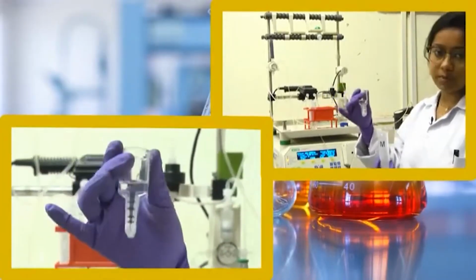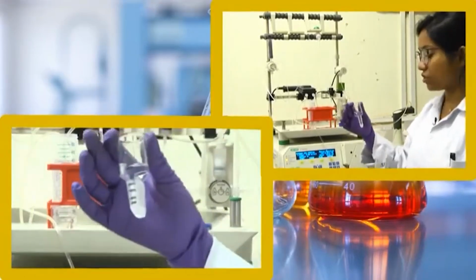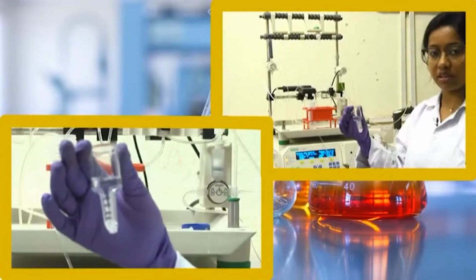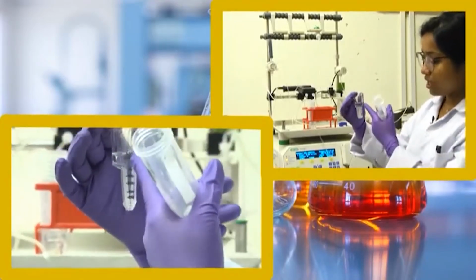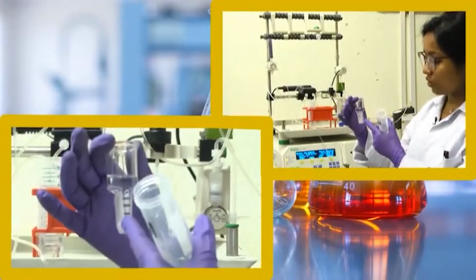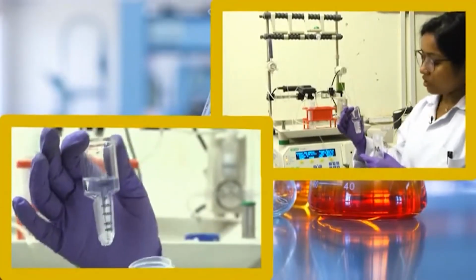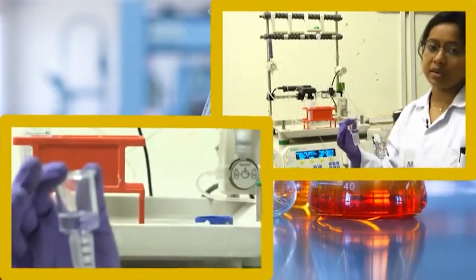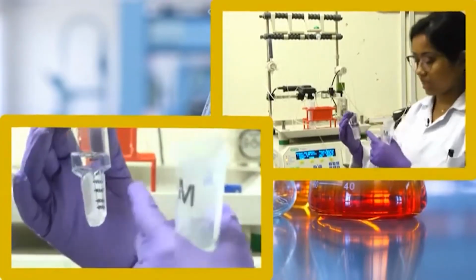So using this type of Centricon instrument, you can concentrate your sample to a certain volume. Here it is marked as well. It is around 15 ml, it can hold 15 ml of sample. So you can go from 15 ml to 1 ml or so. And it will also ensure that if any small contaminants or degraded proteins are present, they will also come out because it has a cutoff.